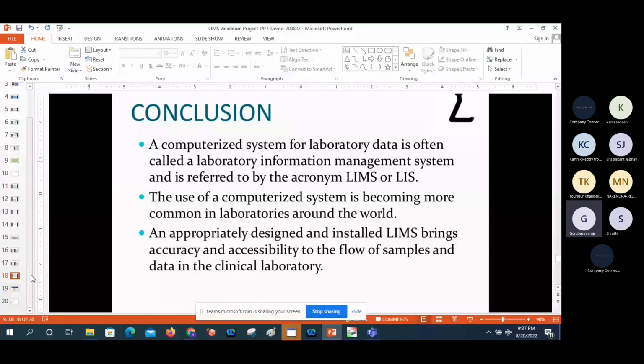Sir, in this training with master data, are you giving any examples also? Any projects by creating master data and template creation and all? Yeah, I have some visible workflows. I will show you. Okay, sir. And template creation and master data creation, everything you are explaining in this, right? Yes. Template is different. I'm not talking about templates.